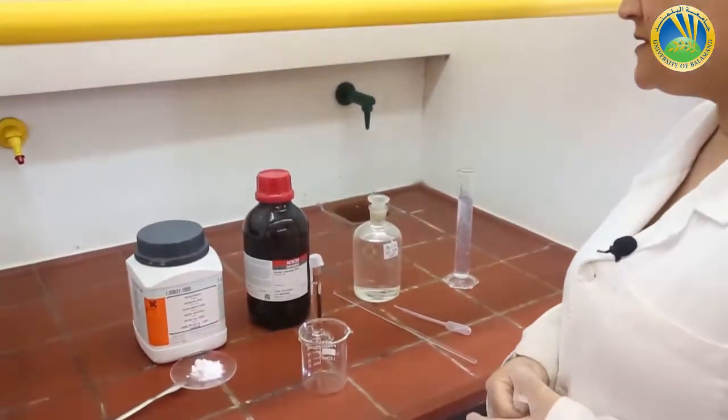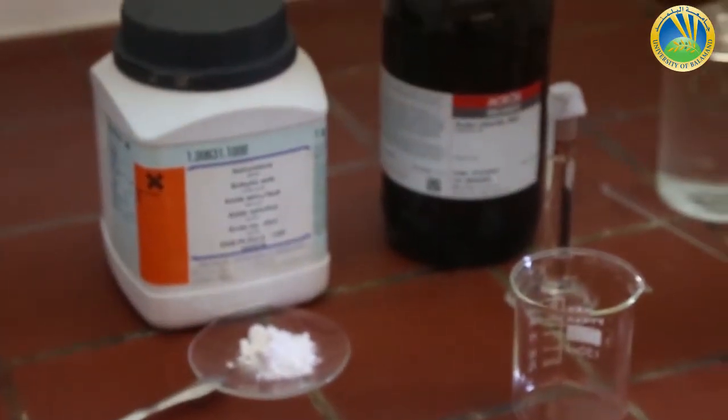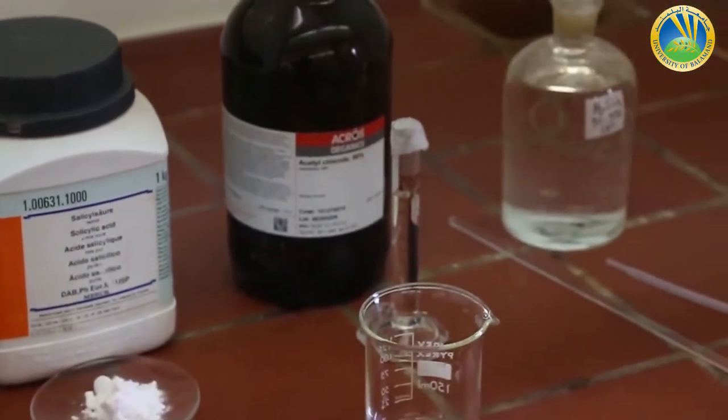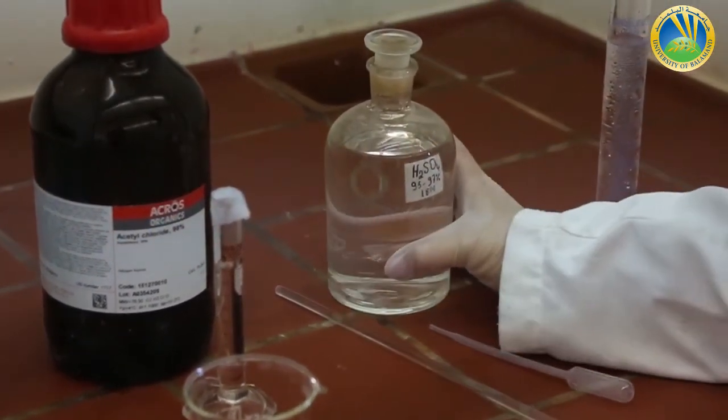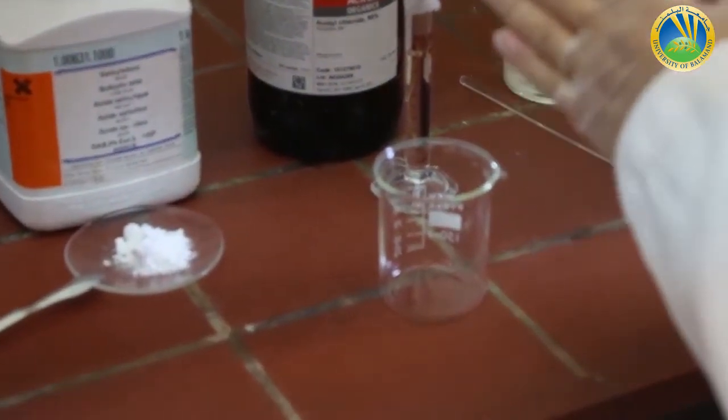To do this synthesis we need 5 grams of salicylic acid, 9 milliliters of acetyl chloride and a few drops of concentrated sulfuric acid. Now I will introduce in order those three reactants.